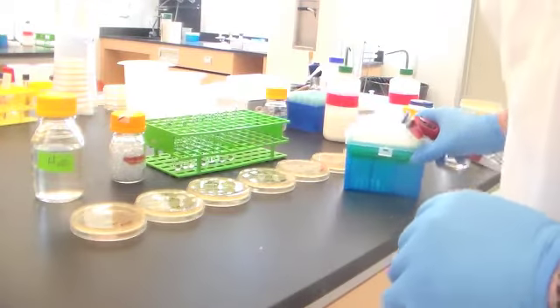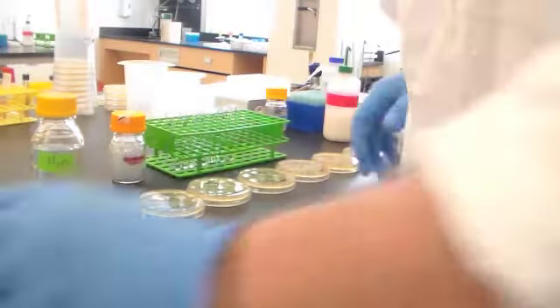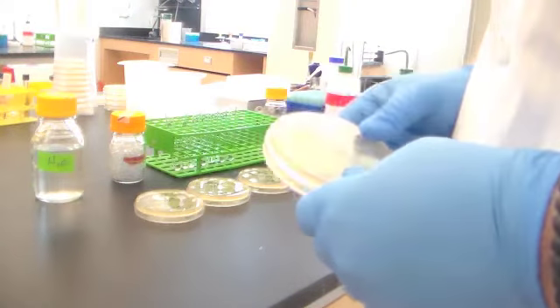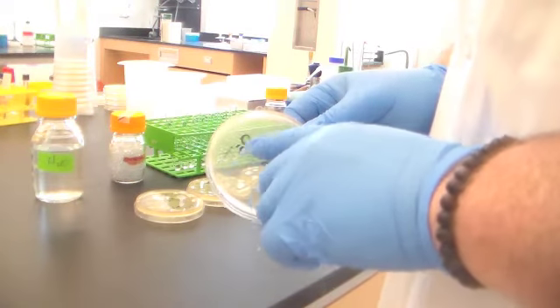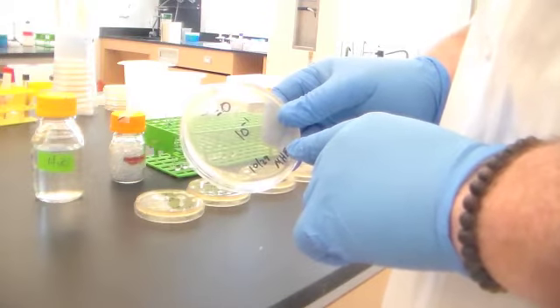I've gone ahead and pre-labeled, as you will do, 7 different plates. These are trypticase soy agar plates. So these are rich media. I've labeled them as time 0, the dilution, today's date, and my initials.